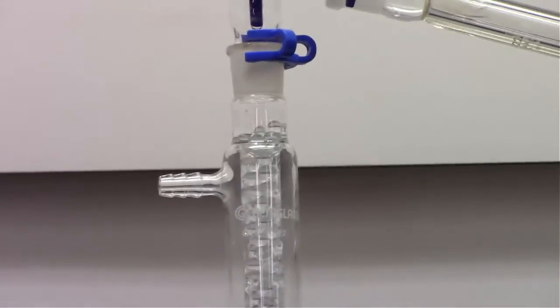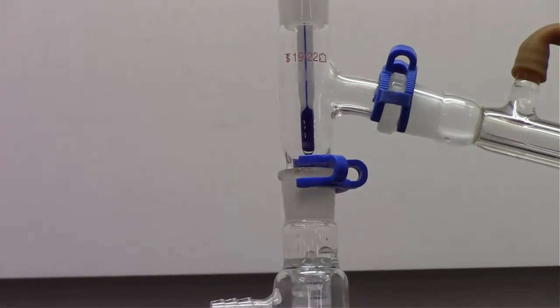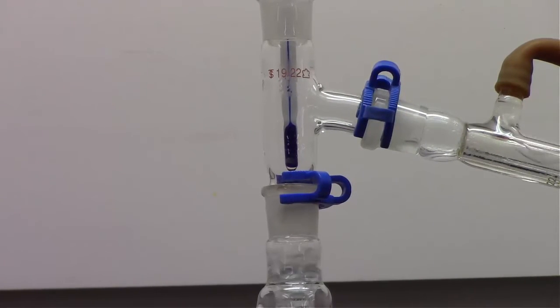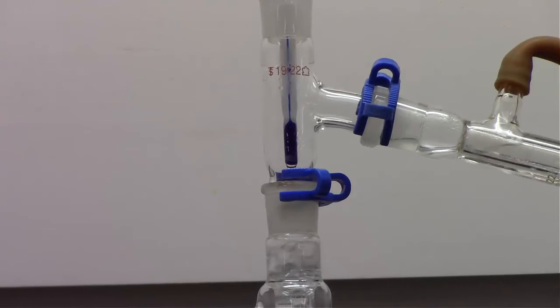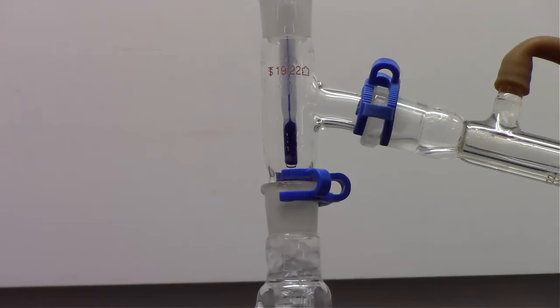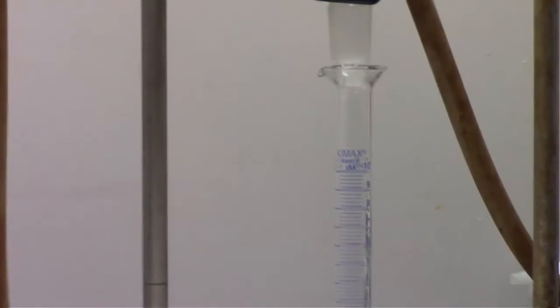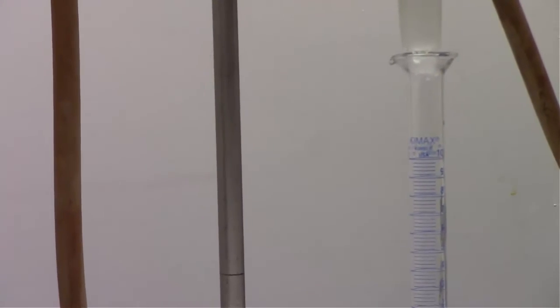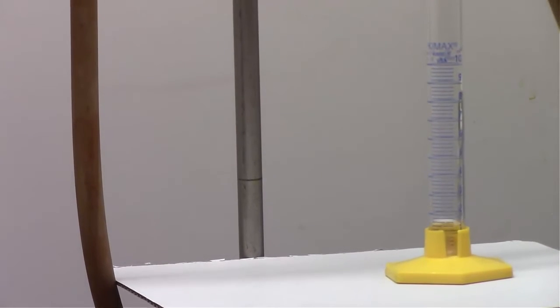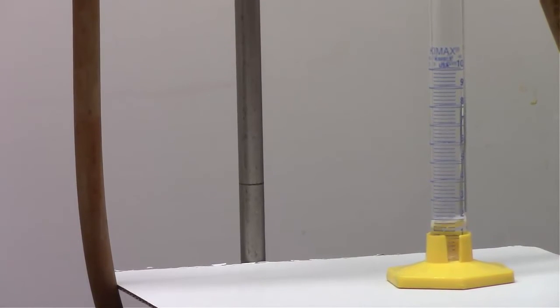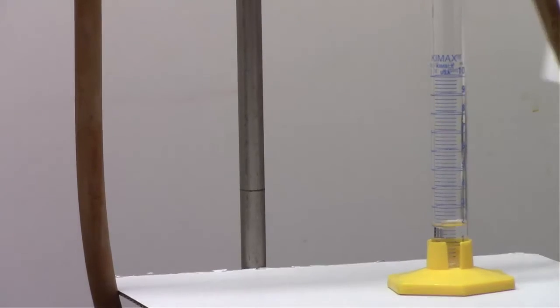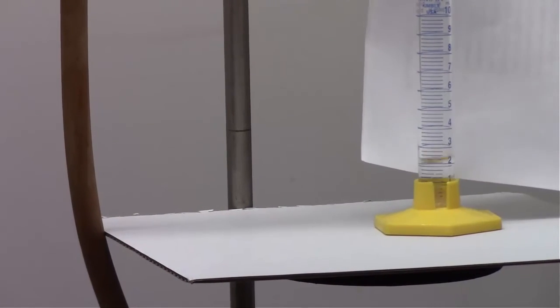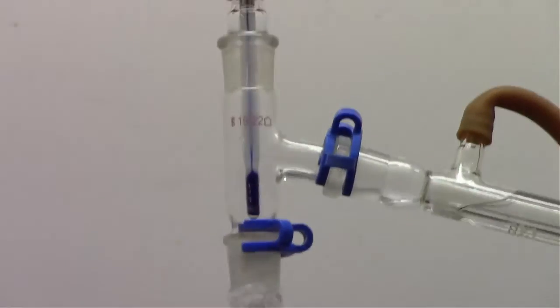I'm also thinking about the last distillation, so for that simple distillation, we could have kept going with that distillation. As we were collecting our 23 milliliters of what at that point was mostly acetone, what we could have done is maybe collected the first 10 milliliters, isolated that. That would have been fairly pure acetone, just a very small amount of water in it. The next 13 would have been still mostly acetone, but maybe only like 95 percent acetone, 5 percent water. So, we could have isolated, separated that 13 milliliters, and then we could have kept going. We could have just cranked up the temperature and then started collecting water at 100 degrees, and then that would have isolated our water with the dye in it. It's hard to say if the dye would come over or not. We'd have to see how well water carried over the dye with it. It's possible that the dye would have been left behind, but that would have been an interesting experiment to complete. But anyway, so we separated the two, but we could have continued that separation by actually bringing over what could have been water or a mixture of water in the dye.